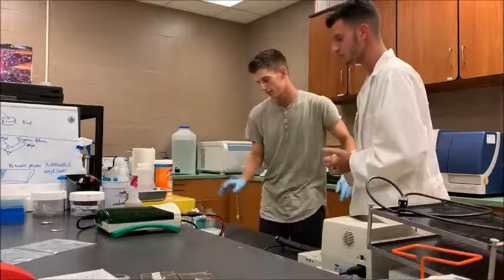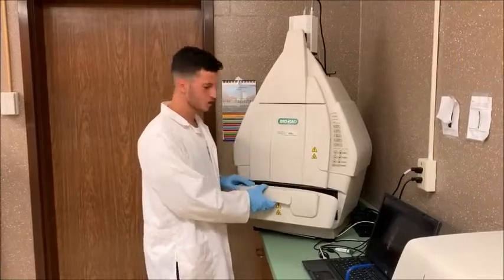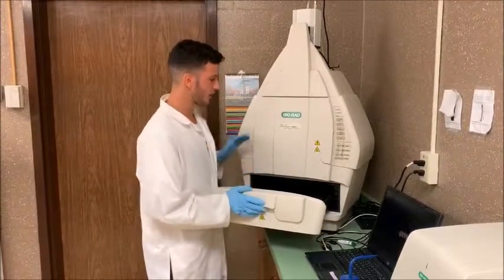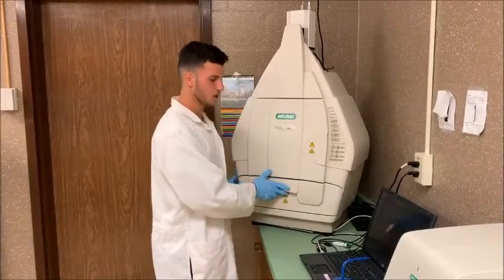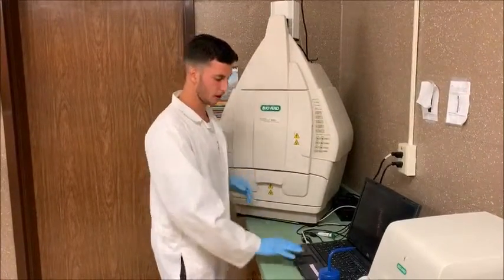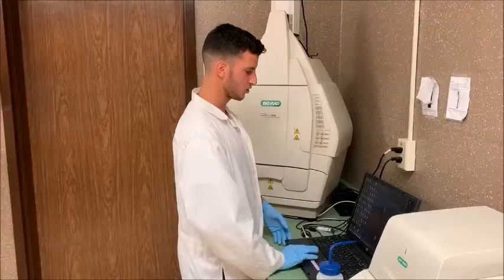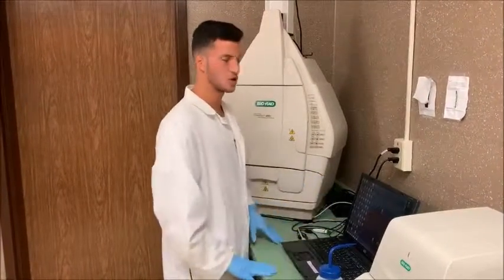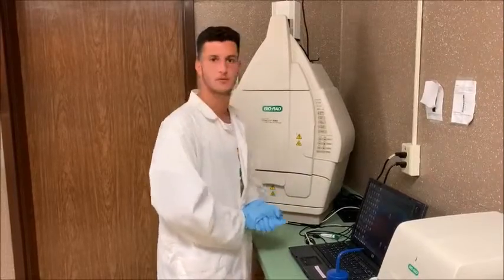Sure. Okay. So this is the molecular imager. Here you will place your gel with a little bit of water, and once placed, you will close it, and the machine will read it, and you will be able to visualize it on your computer on a specific program. You'll be able to visualize your gel for interpretation.